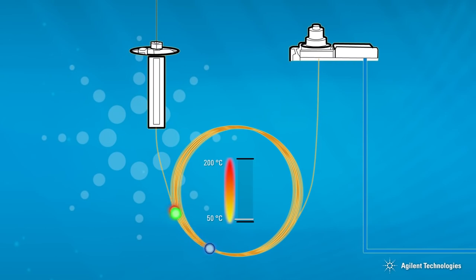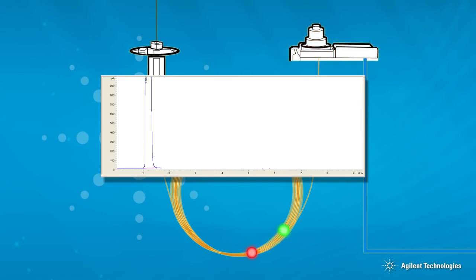The lighter, lower boiling point solvent moves away from the sample components that are being analyzed, towards the detector. The first peak in a GC analysis is usually the solvent peak. It will be very large and often saturate the response of the detector.